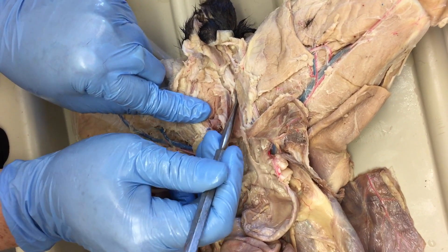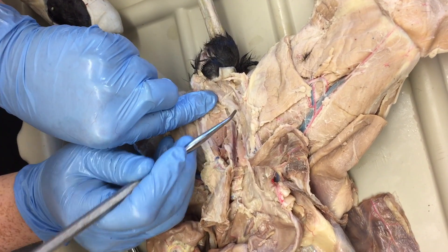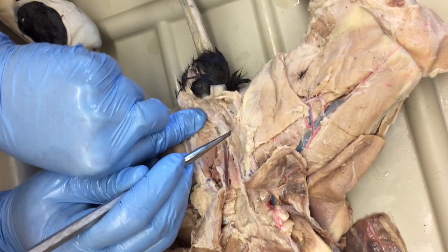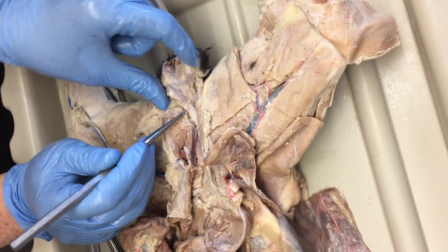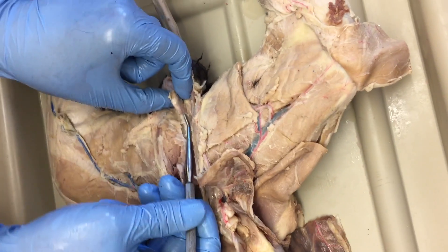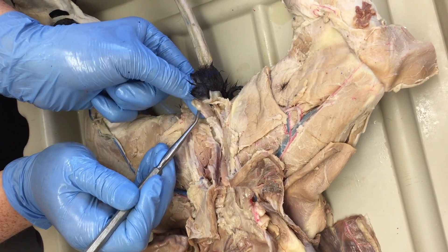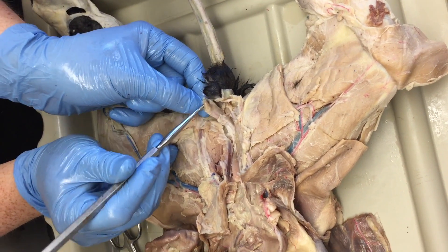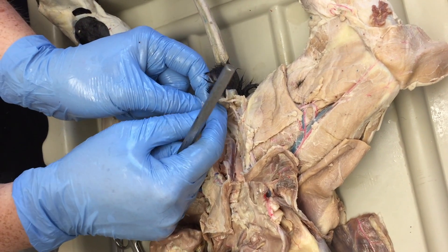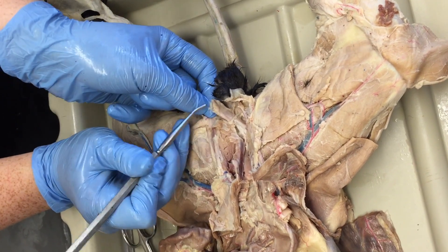The urethra continues on down here, and on either side you've got a little swelling at the base — that's the bulbourethral gland, or Cowper's gland. They provide some of the seminal fluids to help the sperm get where it's going. This is about where it exits the body into the furry pocket, and that's the majority of the penis. Right at the end is the glans penis, and it's got a barbed spiky tip — that's how the male stimulates the female to ovulate.